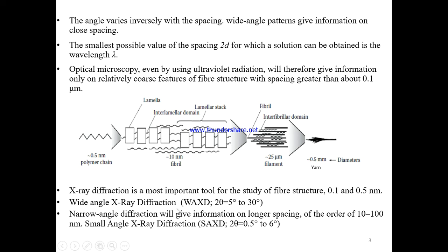In general, from the wide angle X-ray diffraction technique, we can measure the molecular orientation in the crystalline phase, the crystallinity percentage, and the crystal size present inside the fiber structure.